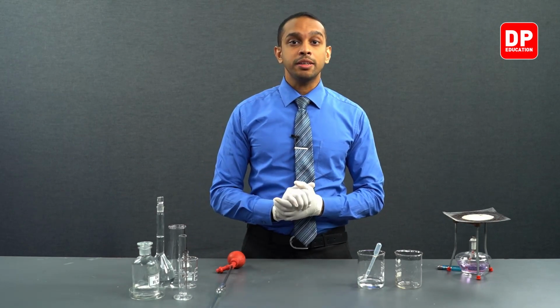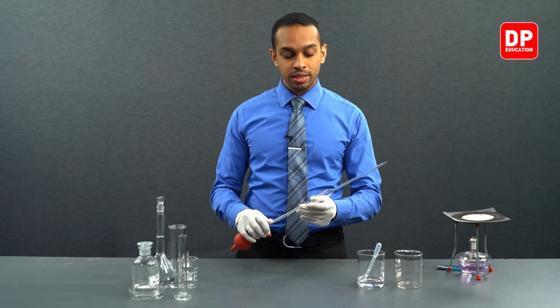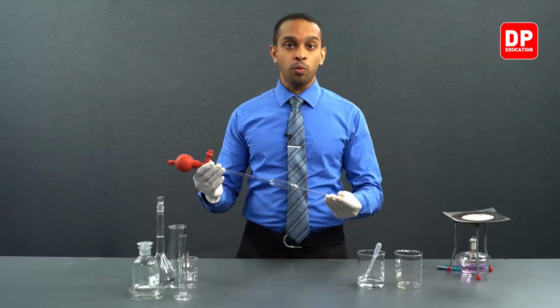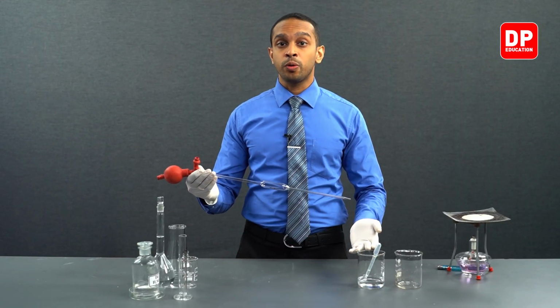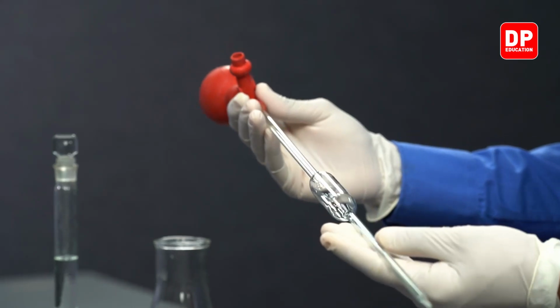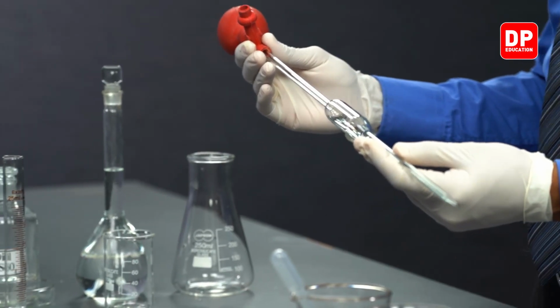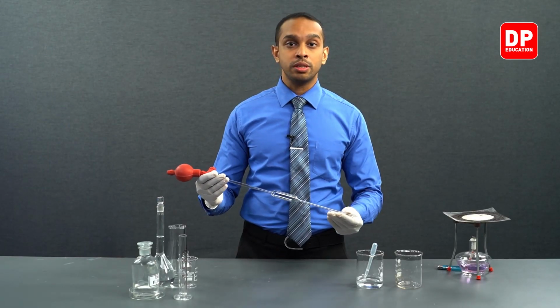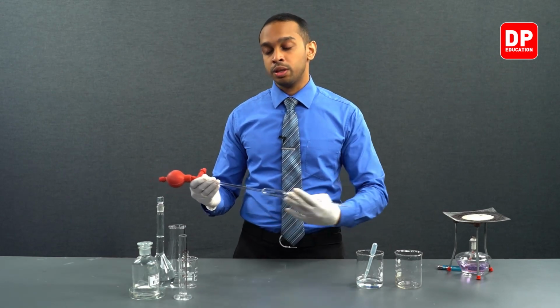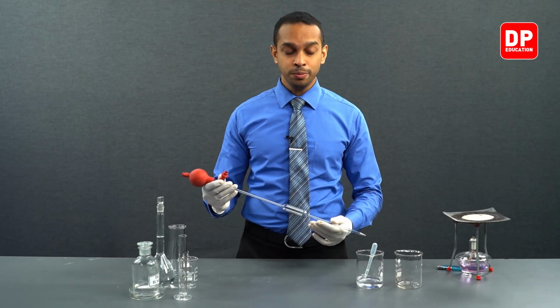In order to do that, we need to first wash our pipette. So let's move on ahead and wash our pipette. We need to first of all wash it with a little bit of distilled water to remove any impurities that it is currently having, and then we need to wash it again with our potassium oxalate solution. Before we fill this pipette with potassium oxalate solution, we have to do those two things: wash it with distilled water and then wash it with potassium oxalate solution. Let's go on ahead and do that now.